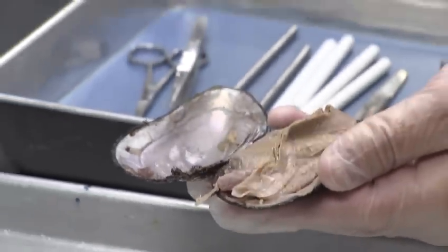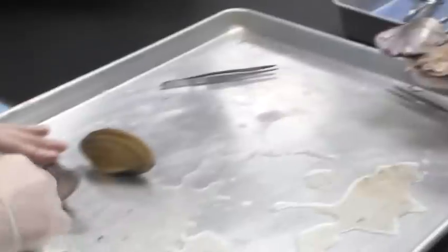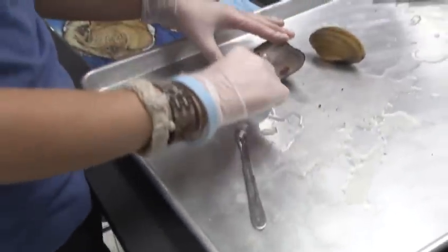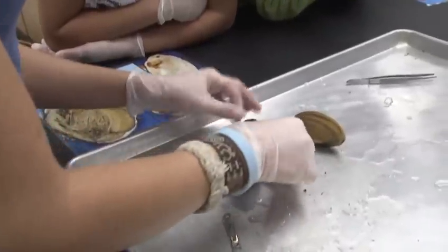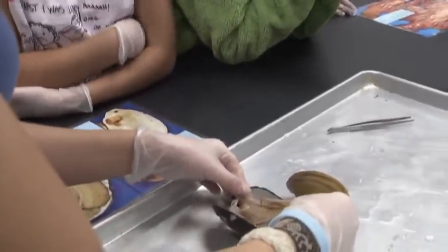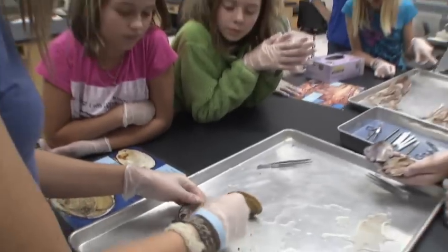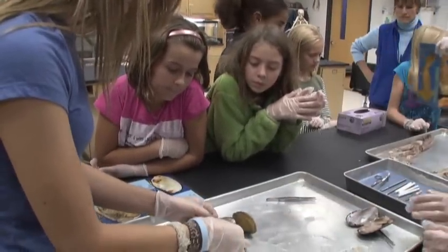And then you open up, like Courtney's over there. Now, Courtney's is a little prettier, I think, than mine. But the part that she's covering up right there, that's the mantle. That skin-like lobe there secretes the shell. And you see the gills right underneath that? The gills are right there. All these things that look like little filaments, those are gills.